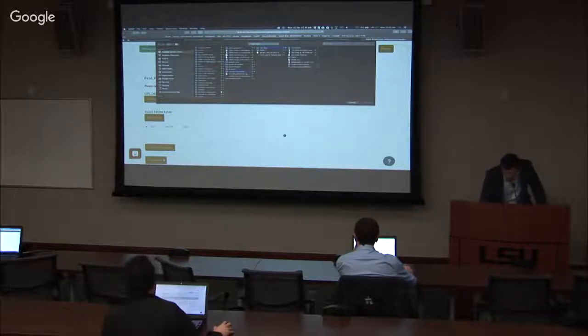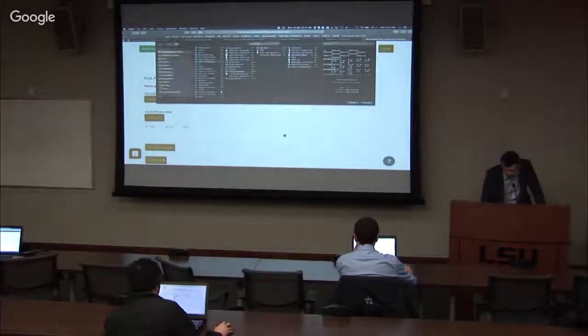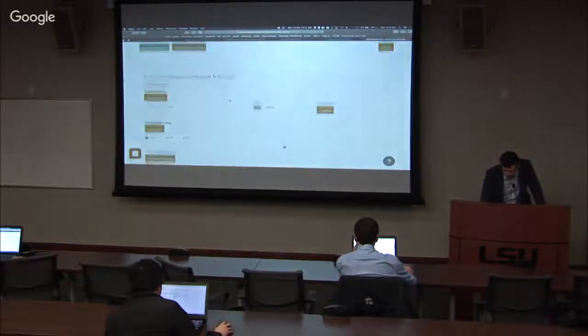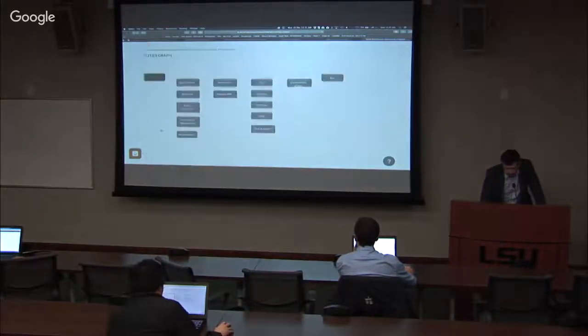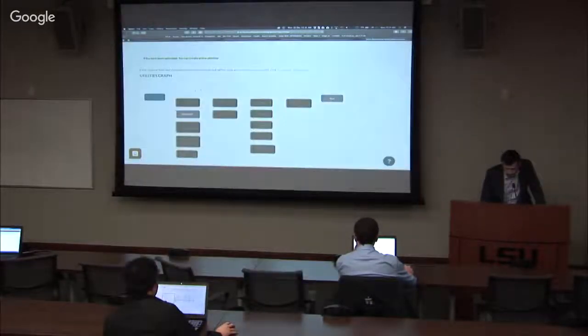You'll go under cell lines, and then you have this cell lines filter 6, which would look something like that. You have your gene IDs and the sample IDs and nothing else. Continue. And here you've got quantile normalization.